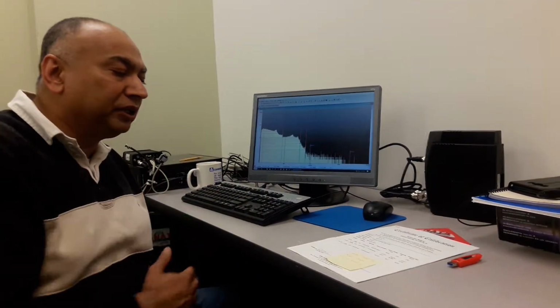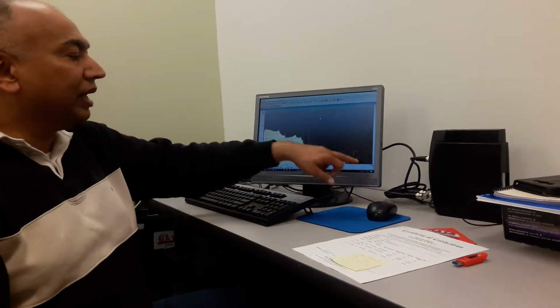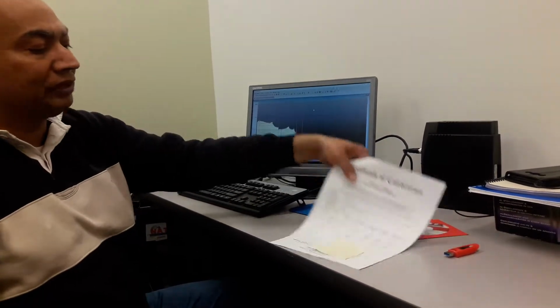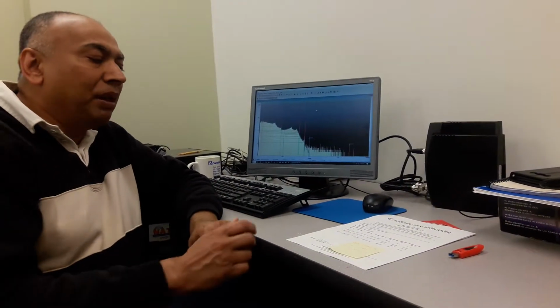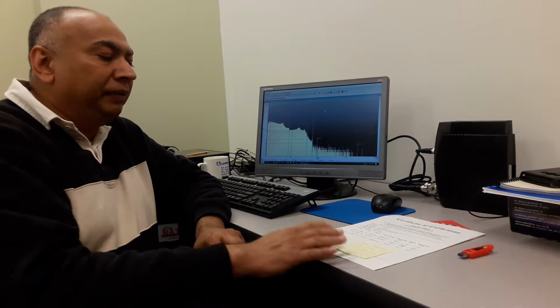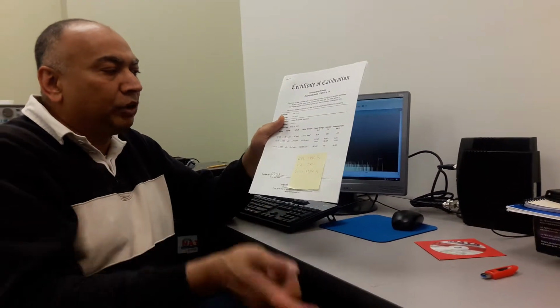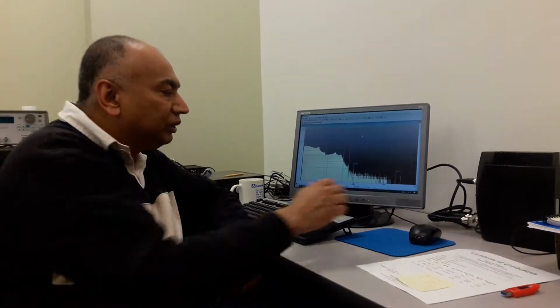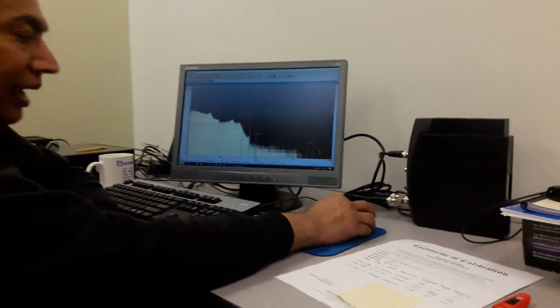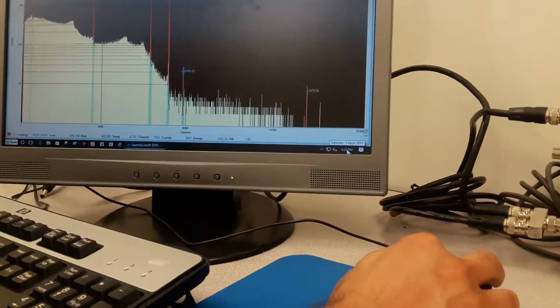One of the fundamental problems that I have seen people run into when they go through this calibration process and set up this calibration certificate file is that they don't correct the date in this computer and they don't match the date with the date that's in here. That creates a problem in calculating the activity to date, because the computer is trying to read from its today's date the date in here, and there is a mismatch. So one of the first things we have to do before we do any kind of calibration work is see what is the format of our date.